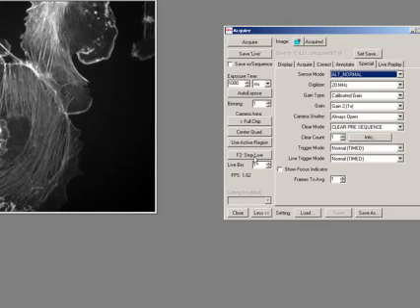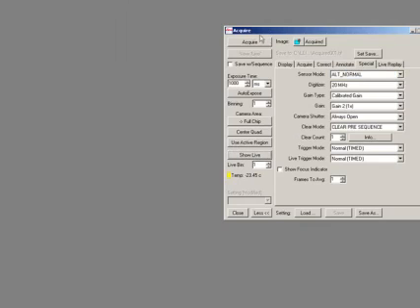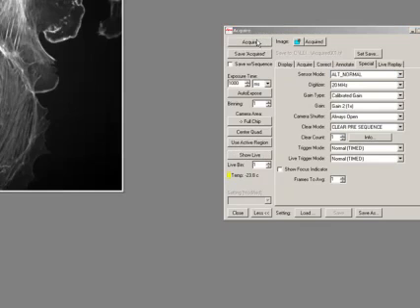So this is a really good tool for working with people with far red dyes and getting extra sensitivity out of them. I can just take a picture as I want, and then I have my images I need to do any work with.